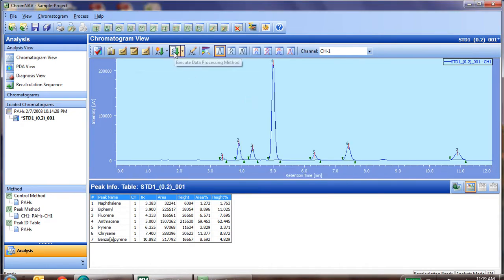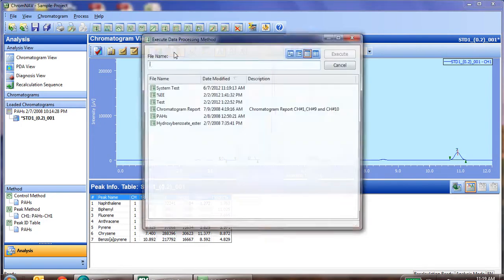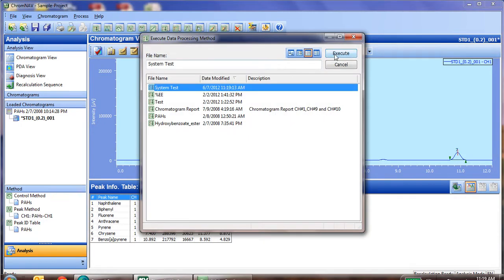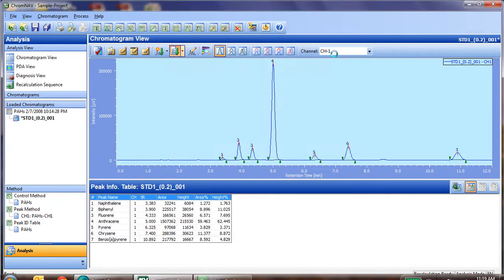Now we just need to execute that data processing method by simply clicking execute, picking our system test, and execute.